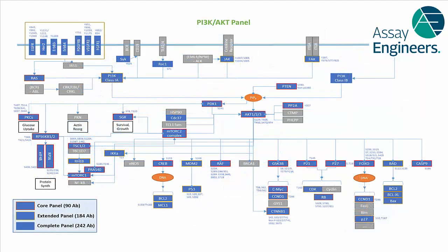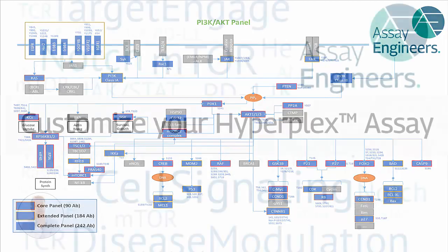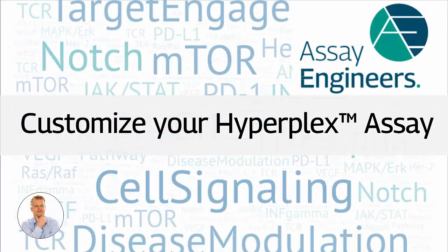Instead, our platform makes validated biomarkers and a wide range of relevant pathway data easily accessible from a tiny sample. With this big picture, your biomarker decision can now be based on a comprehensive understanding of all relevant pathways. Our service lab provides you with actionable data to help you make an informed biomarker decision. And one more thing, Hyperplex is a targeted ligand binding assay platform. We can therefore provide you with the antibody information so that you can use the same clones and the same reagents in multiple programs, ensuring comparability and full transparency for your studies.